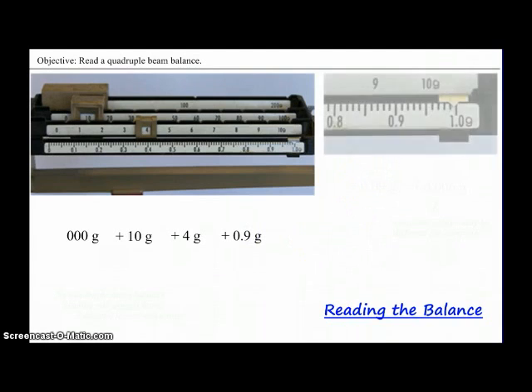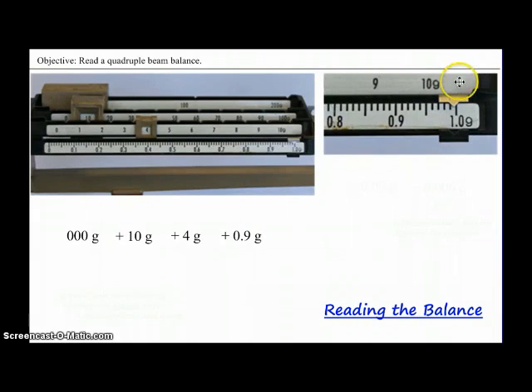Let's get a close-up look at what that 4th rider looks like. We can see on the rider that it has a little metal point to it, and it's that point where we're going to take our reading. When we look at the lines in between the 0.9 and the 1.0 grams, if we start counting from the left, 1, 2, 3, 4, 5, 6, 7, 8, 9, we can see that what it represents is 9 one-hundredths, or 0.09 grams. Those are the lines, and we have read what each of the lines means.